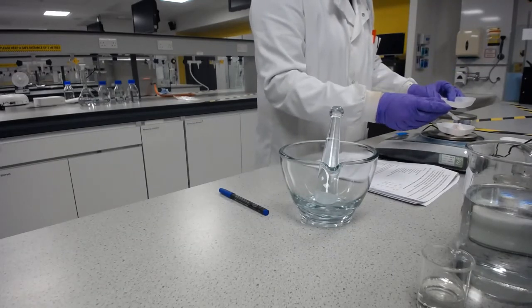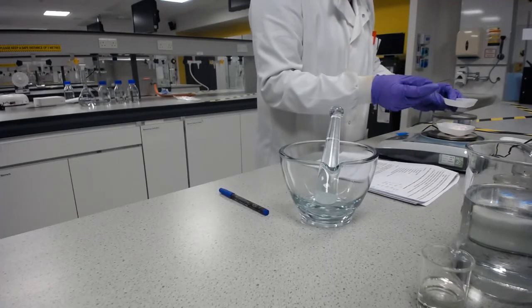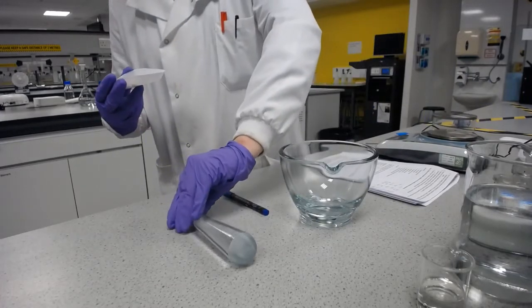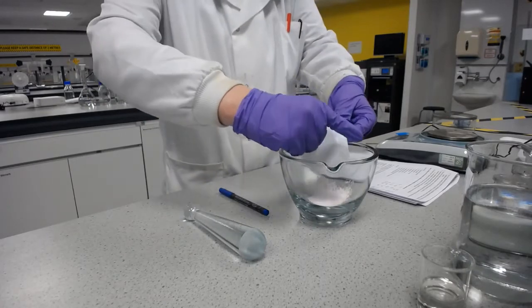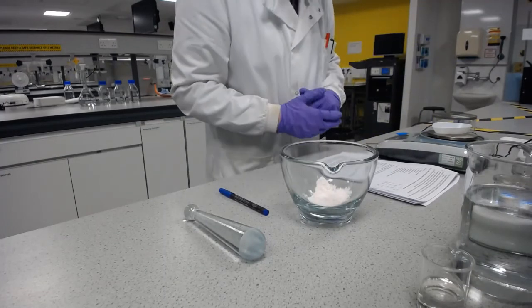And I've put in a bit too much, so I'm taking it off into a spare weighing boat to go into the solid waste. Perfect. So that's going to go straight in. I'm going to use the same weighing boat just so I don't have to re-zero it, and they're all going to get mixed in here anyway.